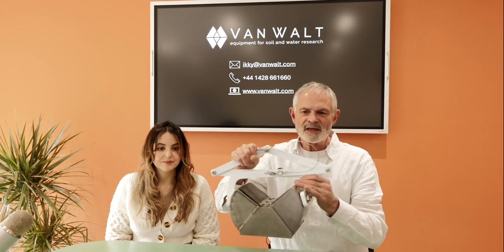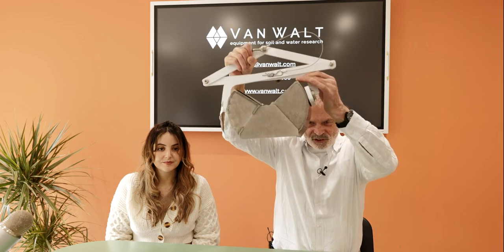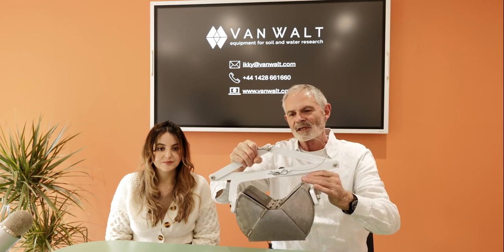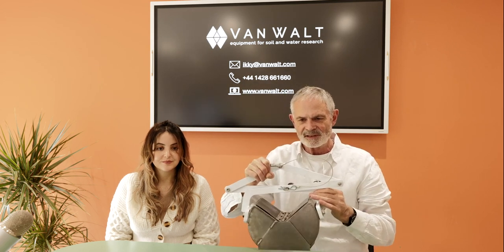The first one that I want to show you is something called a Van Veen grab. Now, this is a device which is lowered from a bridge, from a boat, to the base of your, how do I do this so that I can show it?